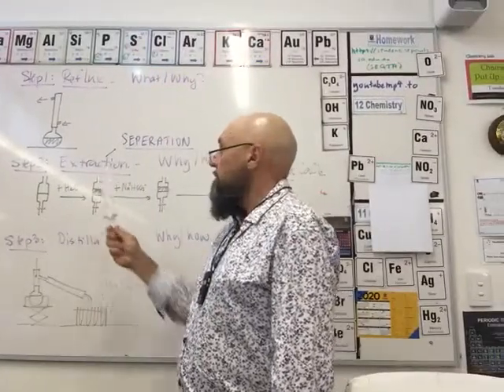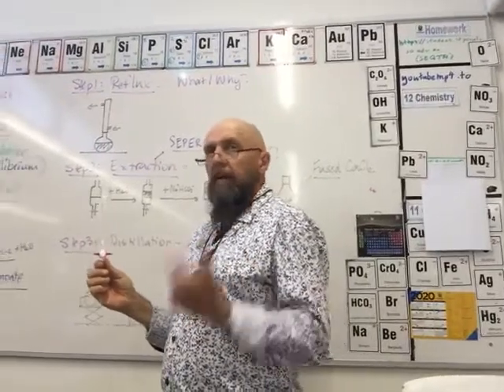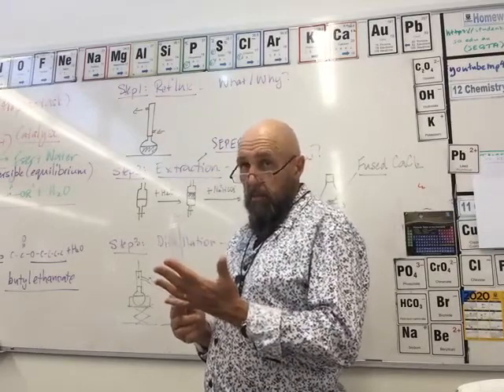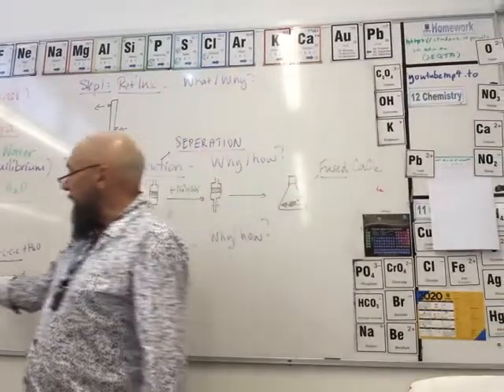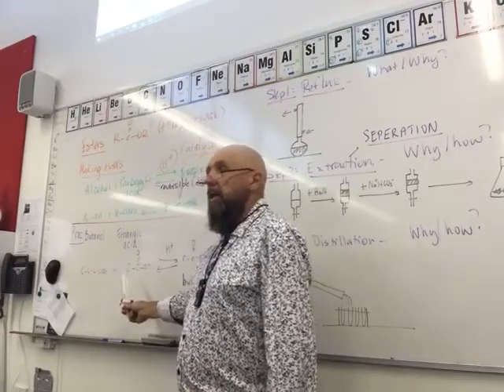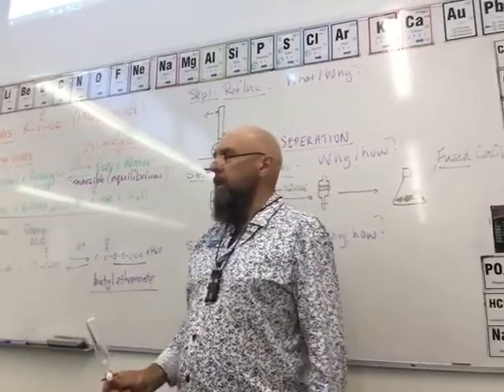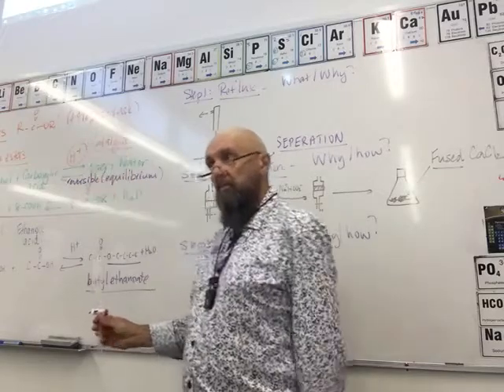In here, we've got the alcohol, the carboxylic acid, the concentrated acid, water, and the ester. By the time we finish this experiment, we're going to have in there butanol, some unreacted ethanoic acid, some unreacted concentrated acid, the ester, and water. It's not rocket science, is it? It's pretty obvious. Just read the equation. So all 5 of those are going to be there.